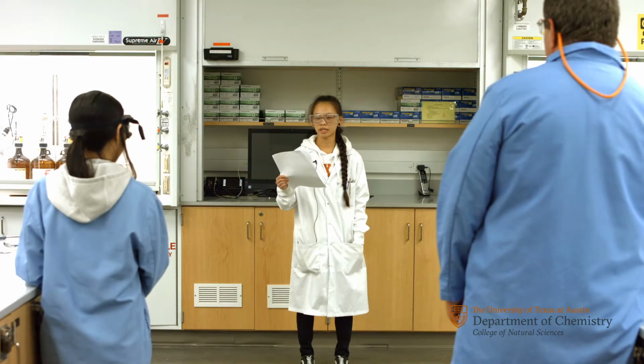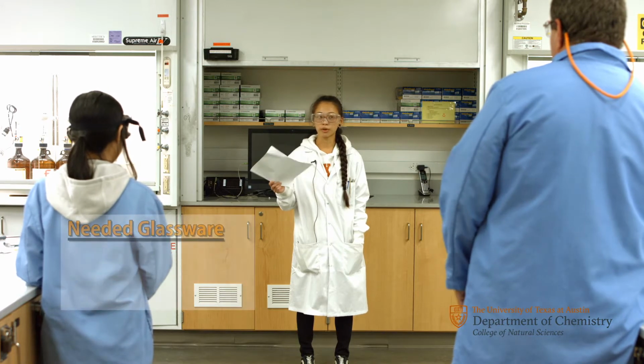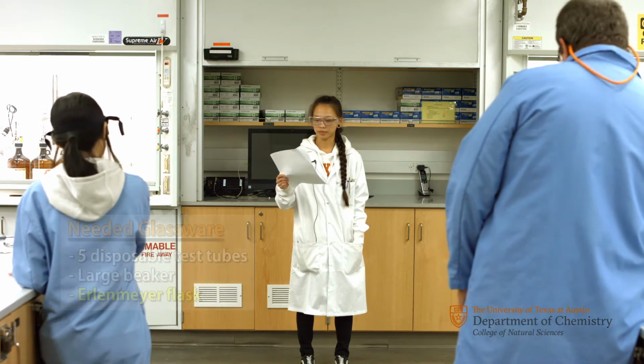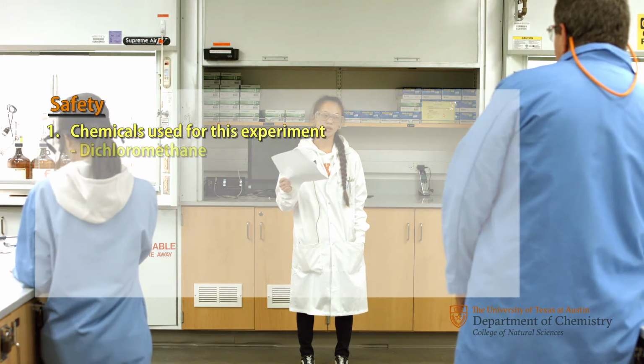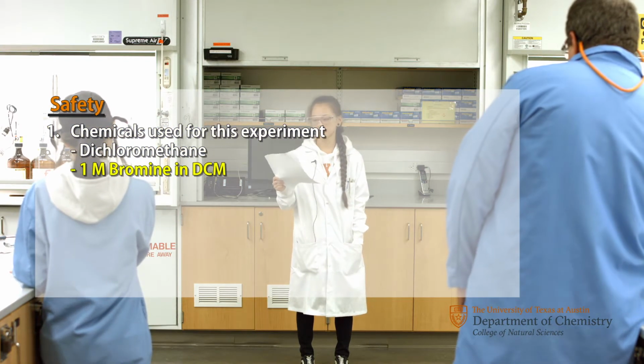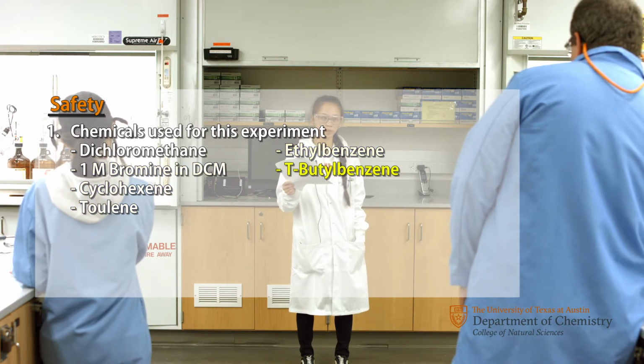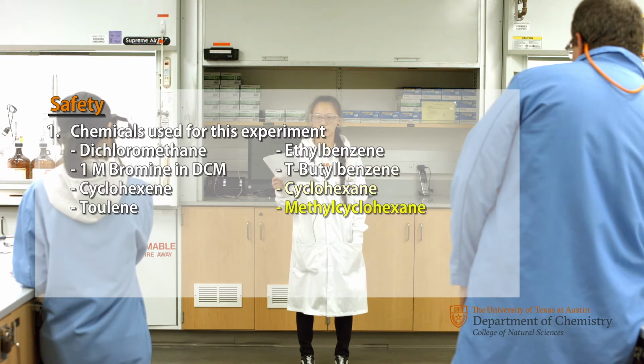Okay, today we're doing the bromination of arenes. You're going to need 5 disposable test tubes, a large beaker, and an Erlenmeyer flask. The chemicals we're using today are dichloromethane, 1 molar bromine in DCM, cyclohexene, toluene, ethylbenzene, tert-butylbenzene, cyclohexane, and methylcyclohexane.